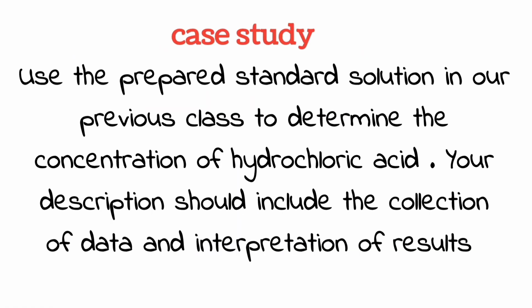Now things are getting hot in here, and we are going to enter the lab and titrate a solution. We have a case study on the board. It says, use the prepared standard solution in a previous class to determine the concentration of hydrochloric acid.